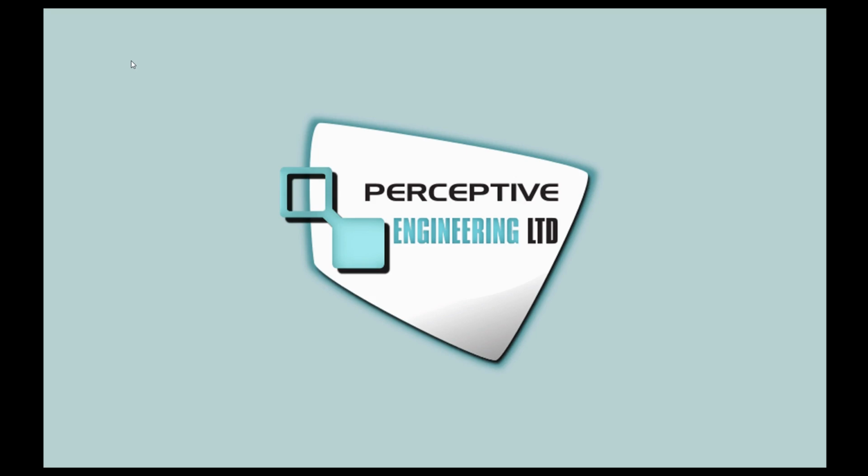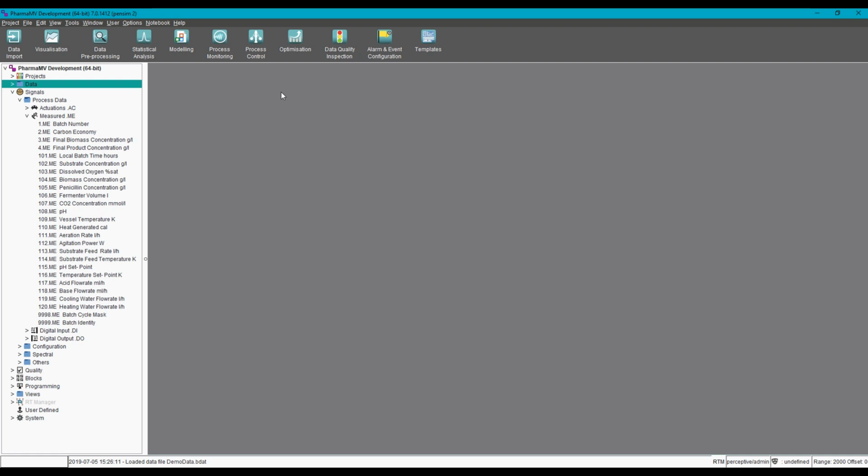Hello there. In this short video, I'm demonstrating another new feature in the version 7 release of the Perceptive APC development system. This time, I'm going to show you the enhanced DataMask functionality. Now, DataMasks have been used within the software for a long time now as a means of time slicing processed data. Among the latest enhancements is the better integration of masks and trends, which I'll show you now.